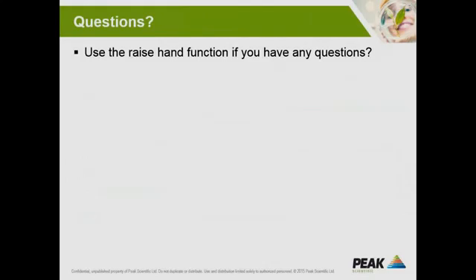Okay, we have Mr. Tosif here, who I've just unmuted. He's asked how many GCs can be connected to one nitrogen generator. Mr. Tosif? Okay, so is this for carrier gas? This will depend on the total flow rate of each GC method.